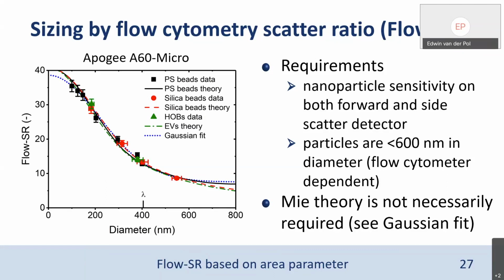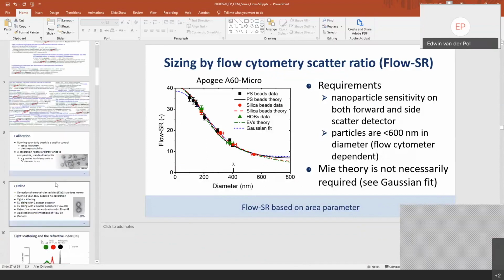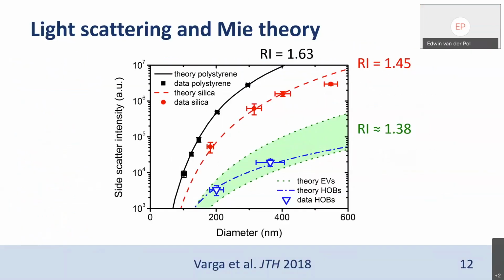Yeah, these beads were published recently in a separate paper. Just a nice add-on to validate that our Mie theory is also correct in the low refractive index range. So, I can show this. Here are the hollow silica beads.